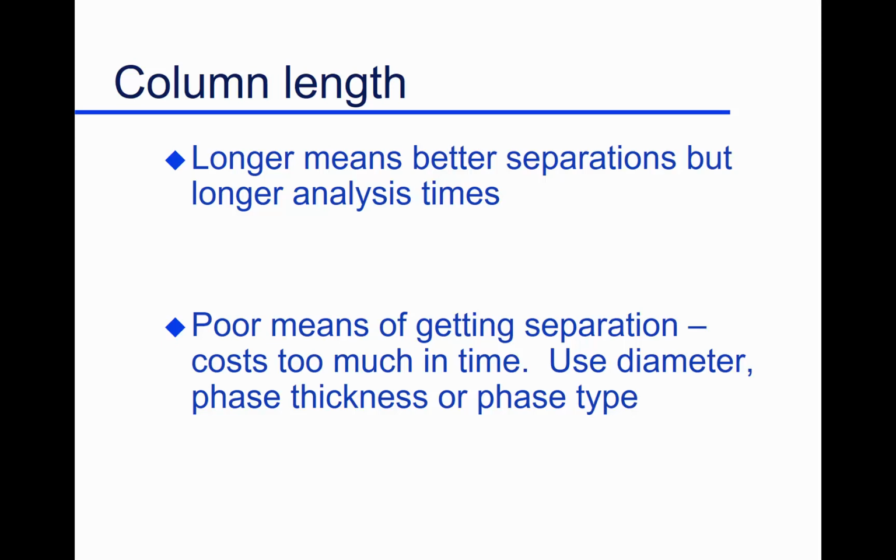It's costing you time. So what do you do when you have really problems, or we want to get, let's say, fast separations, efficient separations? You use small columns, you use thin phases, you use short columns as much as possible, you use rapid gas flow. So those things we've been talking about, what I've been mentioning, are things you go for.